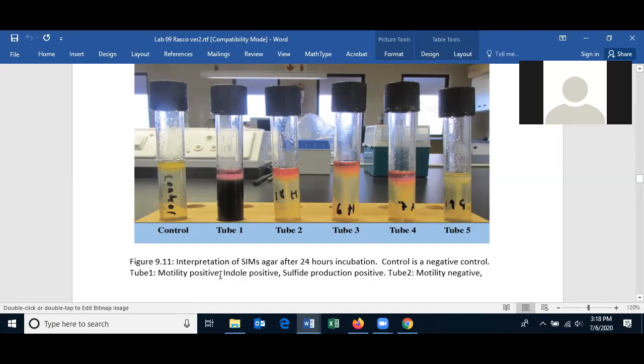That one is just one that, when we're looking at this, it's hard to see on this one because motility is everywhere. But if this was producing hydrogen sulfide, this region of the tube would be not black or very, very lightly colored, because there shouldn't be hydrogen sulfide production where there's no bacteria, okay?